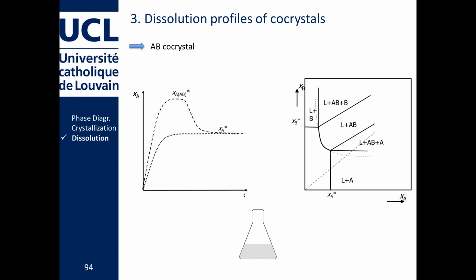Then I do the same for my co-crystal. Nice, you can go up. Same idea: if I go up the stoichiometric line, 1-1 stoichiometry, for one equivalent of caffeine, there's one equivalent of maleic acid appearing. I see my amount of caffeine, of course, going up. I go up very high, up until what point? Up until the point that I reach the solubility curve of my co-crystal, up until this point here. Because crystals usually have a tendency of dissolving quite rapidly, this is called a spring behavior in literature. So you have a spring behavior, a very rapid dissolution.